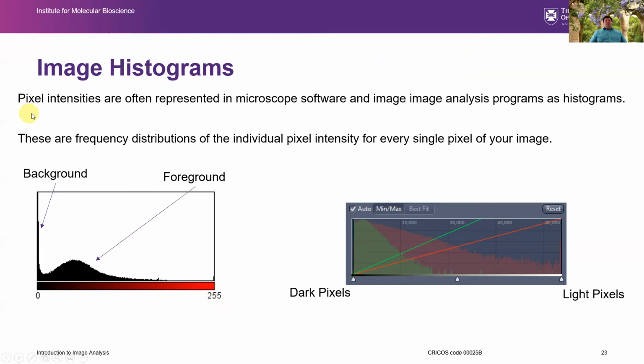So a histogram is just showing that the pixel intensities are representative across this range, either by a logarithmic scale or just by summing the number or the frequency of them. And so where you have an object that sits above background, then you can safely know that you should be able to segment because you can see this dip.